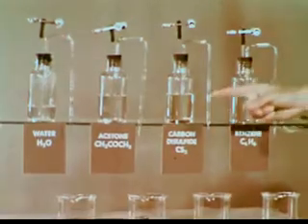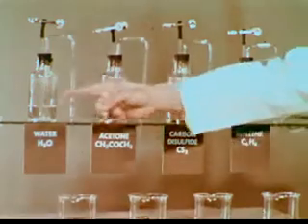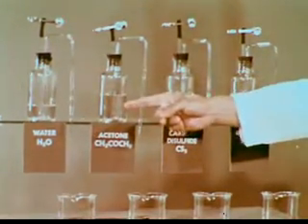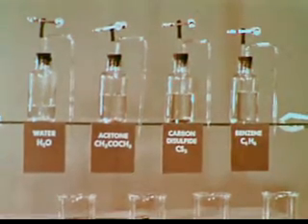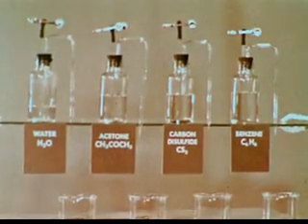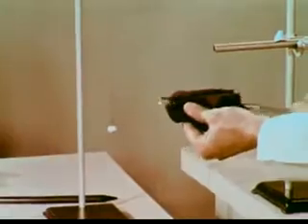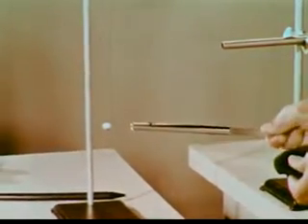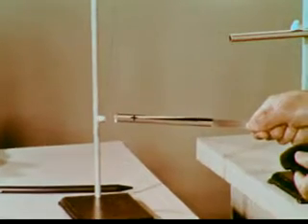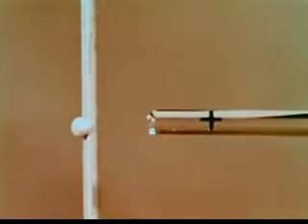Why does a negatively charged rod have no effect on carbon disulfide and benzene, and yet does deflect water and acetone? Is it possible that the streams which are deflected are charged positively and the others are electrically neutral? If this is true, a positively charged rod should repel the deflected streams. A glass rod rubbed with silk repels our sphere. The glass rod is electrically positive, as shown by its repulsion of the positively charged sphere.